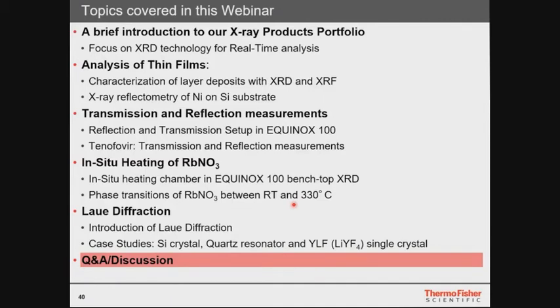Mirrors, on the other side, use the total reflection of the X-rays, using the same principle as monochromators by using the different total reflection angle, which also depends on the wavelengths. And this allows you to separate K-alpha from K-beta radiation, for example, but you get high flux. So you have two sets of reflections left, K-alpha 1 and 2, but you have a very high flux, so high intensities and shorter measurement times.